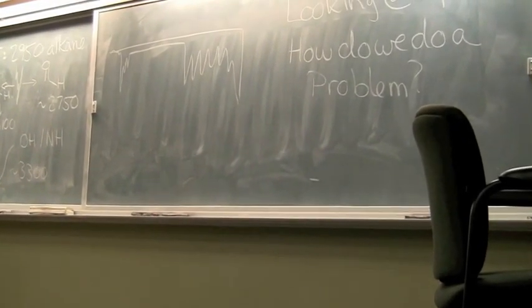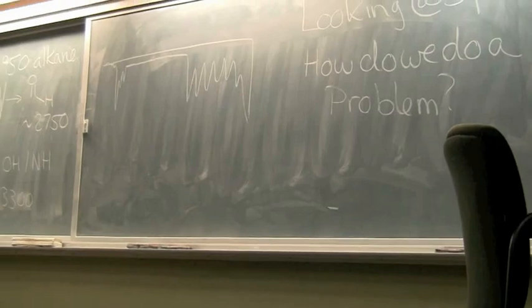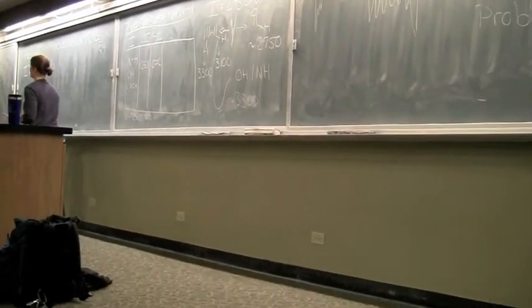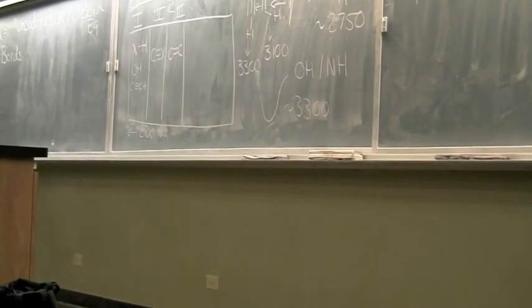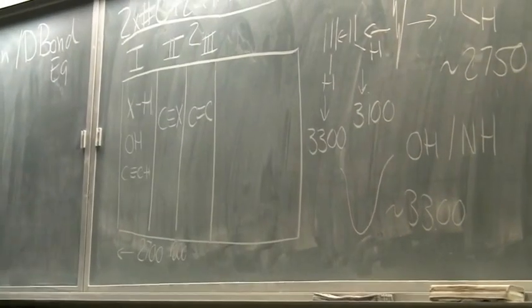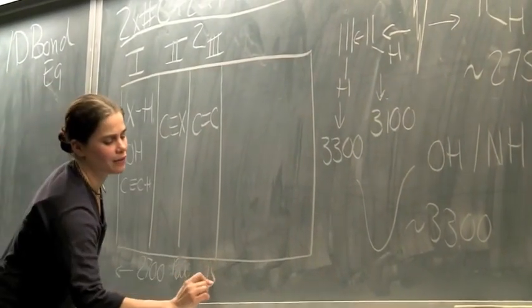Go a little lower, zone 3, double bonds. Carbon-carbon, carbon-oxygen. You can get carbon-nitrogen bonds. They don't tend to show up till later, but they exist. So that's your double bond region. Look at 1900 to about 1500.